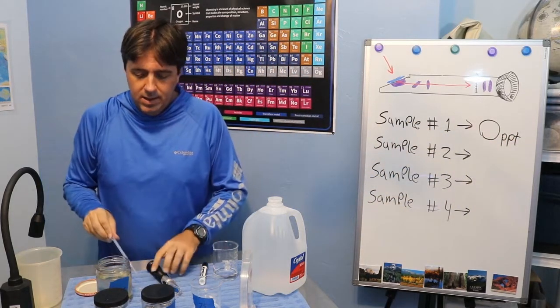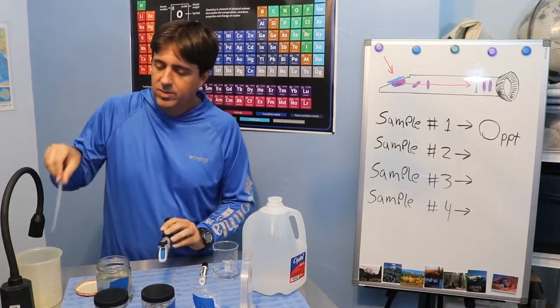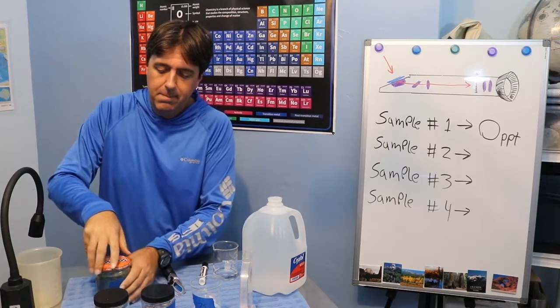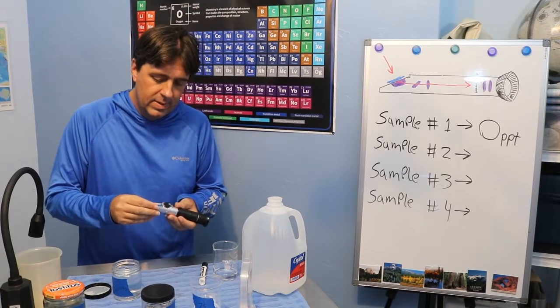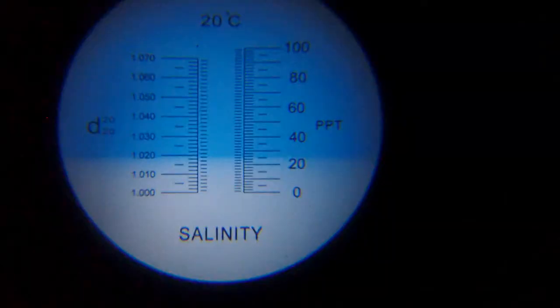So now this is my wastewater. I'm going to use the distilled water, kind of clear out my pipette. And now let's move to sample number 2, which is going to be the lagoon. All right, this one looks like it's going to be 25 parts per thousand, and it's in the lagoon.